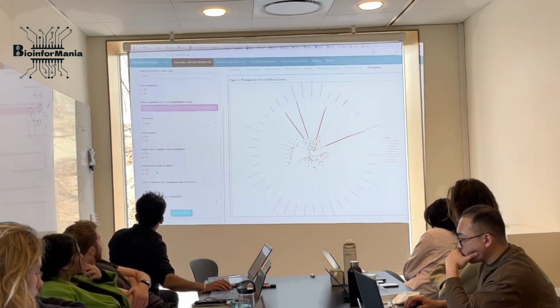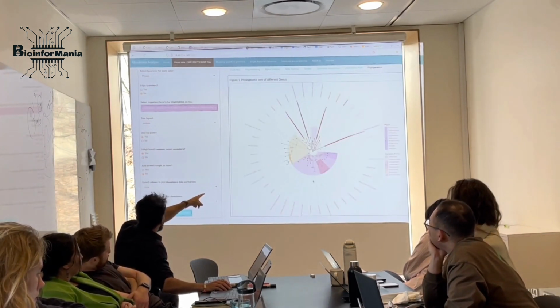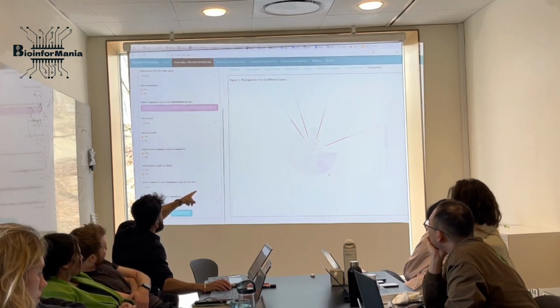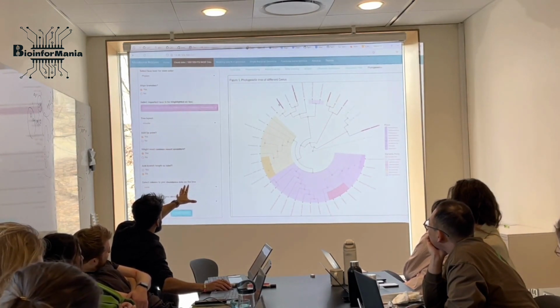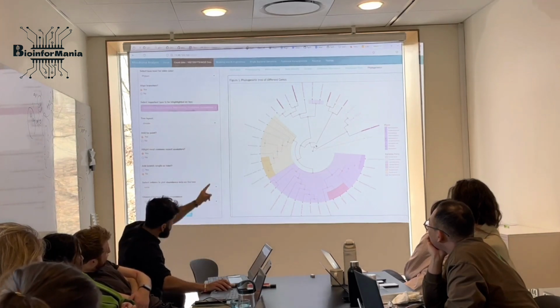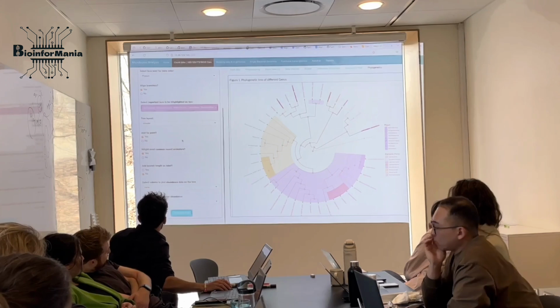You can also add that, I believe. Yeah, highlight the most recent common ancestor. That's it. So ugly, this line. Right? Better. It takes a little bit more time to read it, but better. You know what I mean? You cannot immediately see the distance, but when you look a little bit deeper, you see how they're distant from each other. And the clade is very intuitive, it tells you.